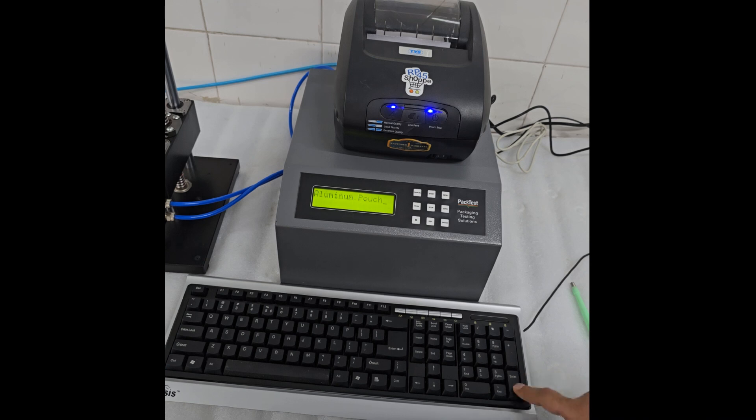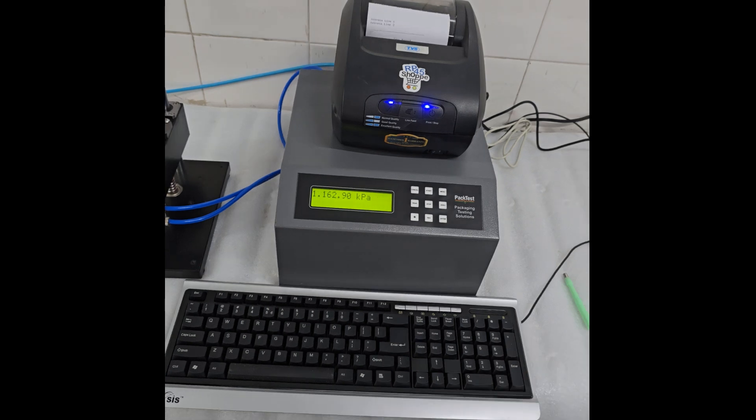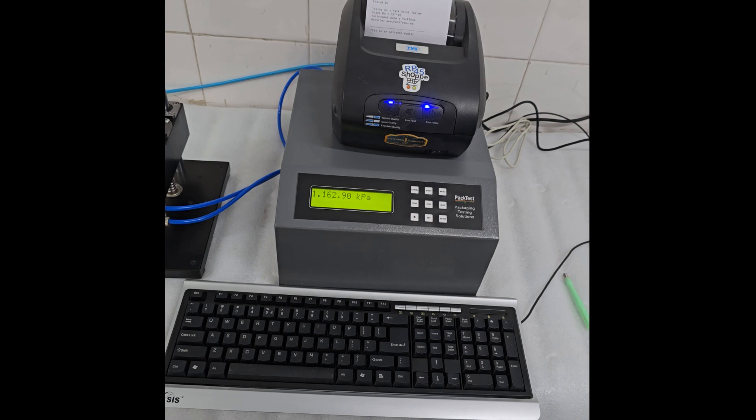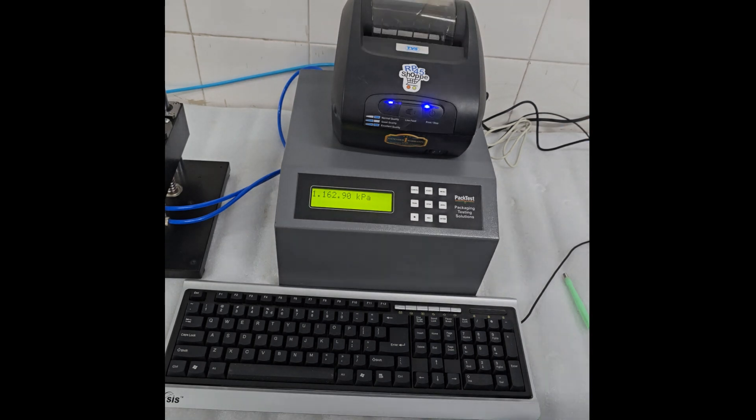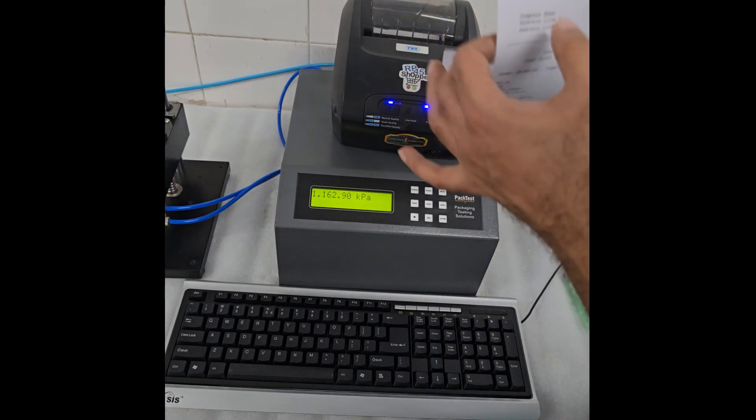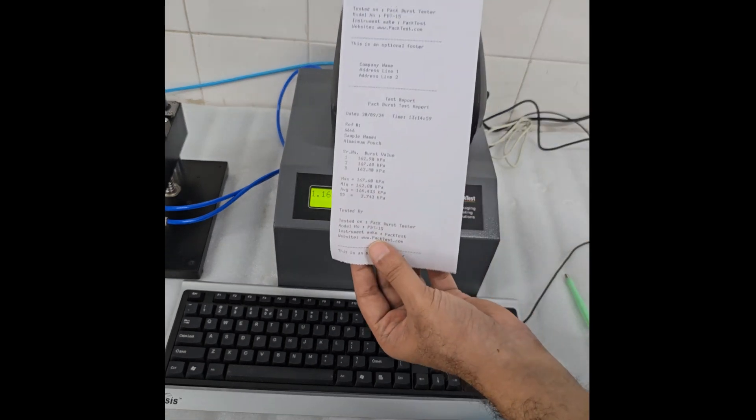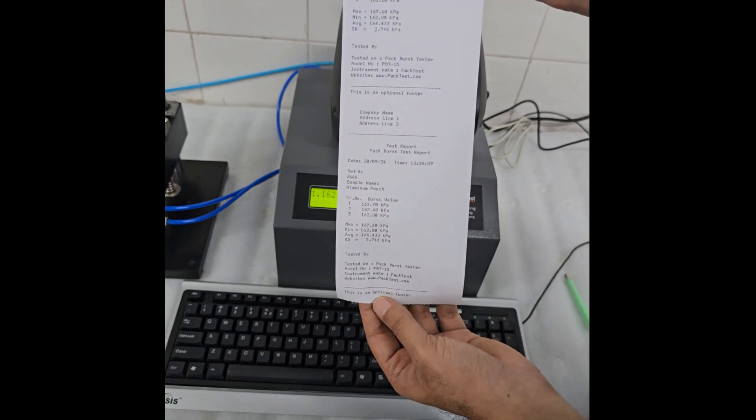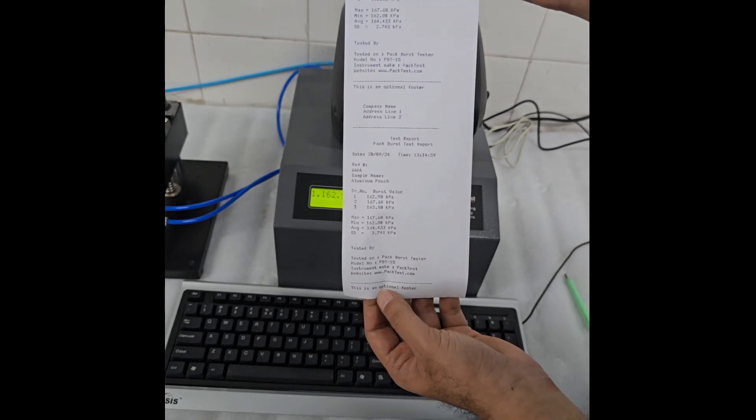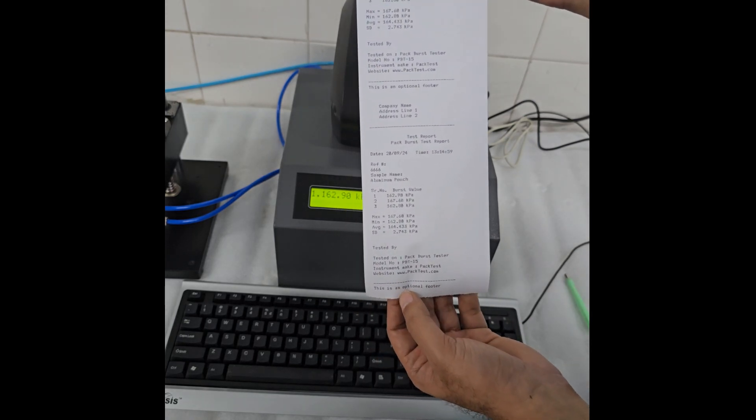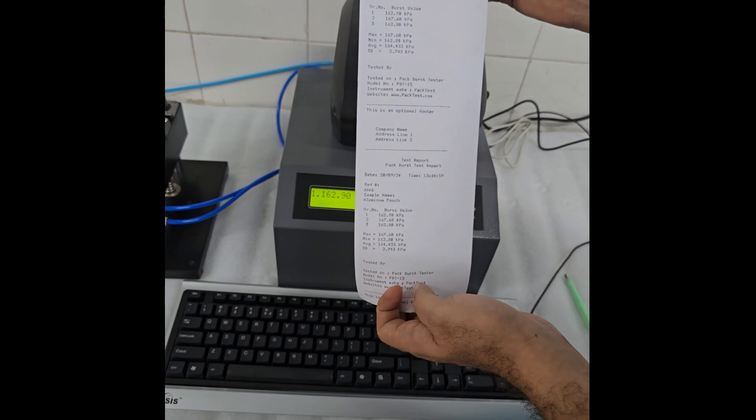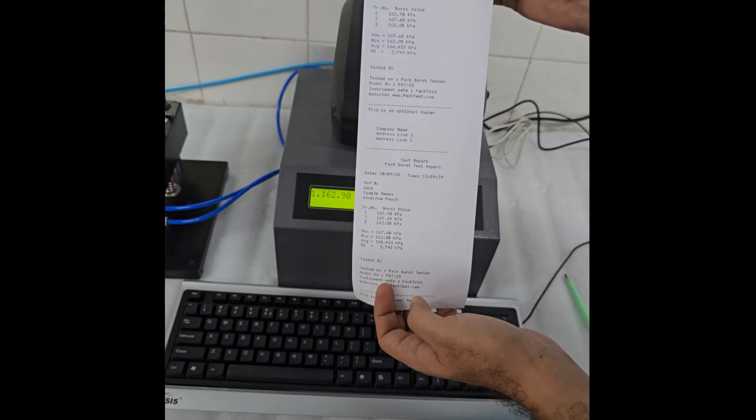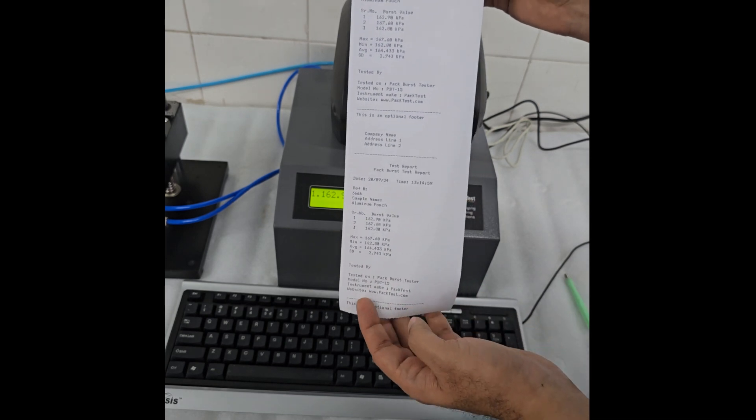The test report will now be printed. The report contains your company name, address, test date and time, individual test results, maximum, minimum, average, and standard deviation. It also contains a place for you to sign. It can also show an optional footer line.